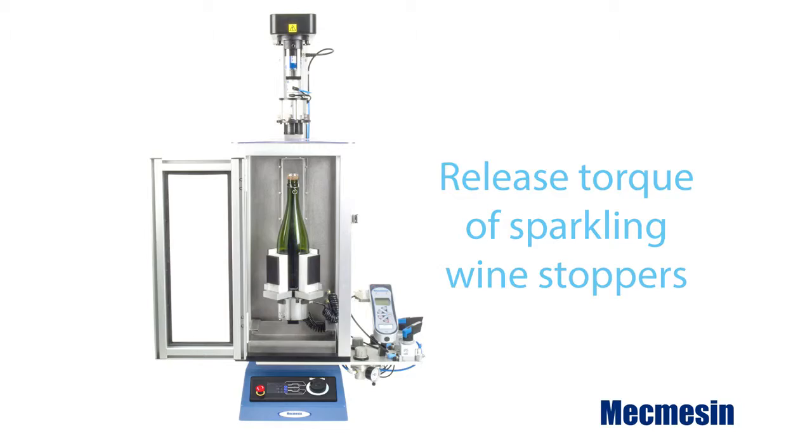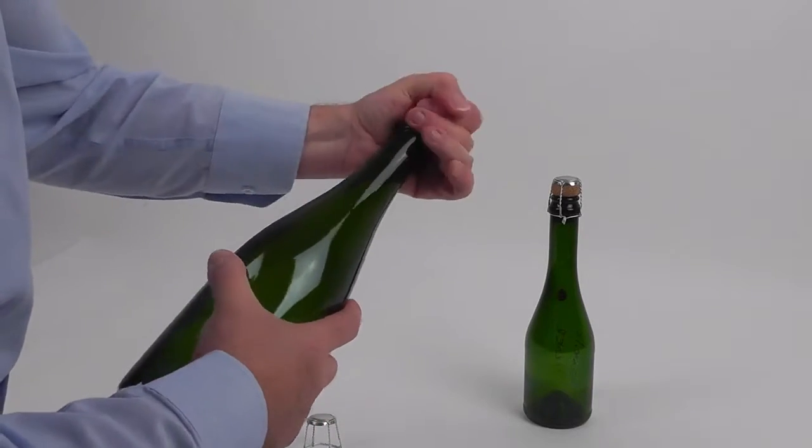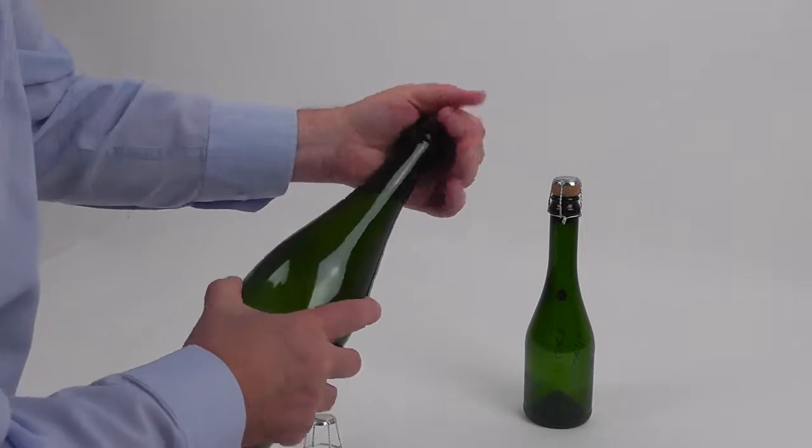The semi-automated system simulates the helical action of twisting the cork while simultaneously applying a tensile force to extract the cork.